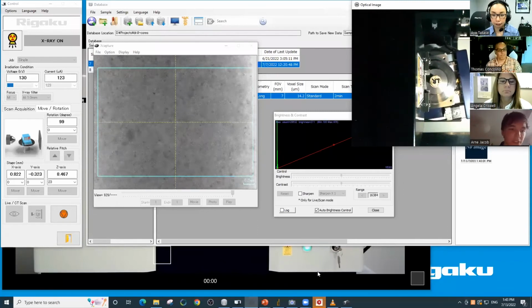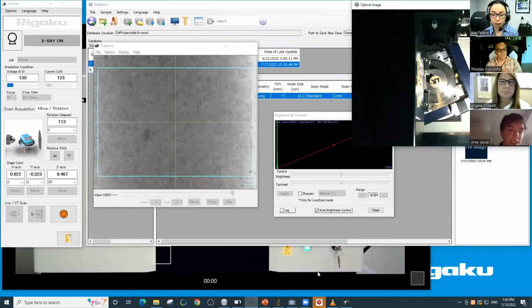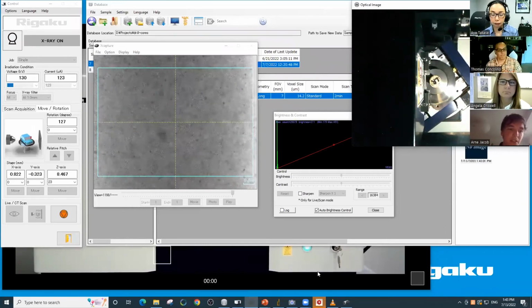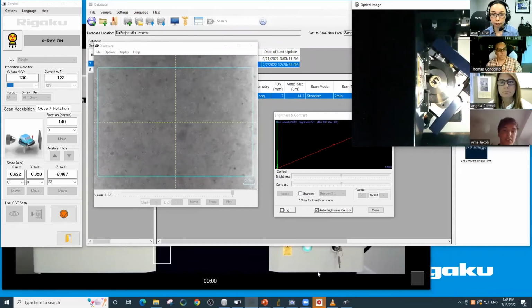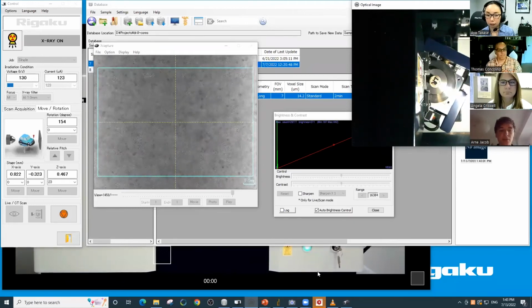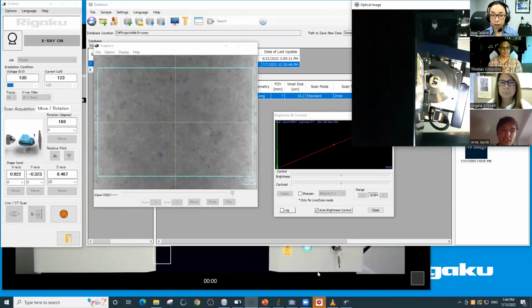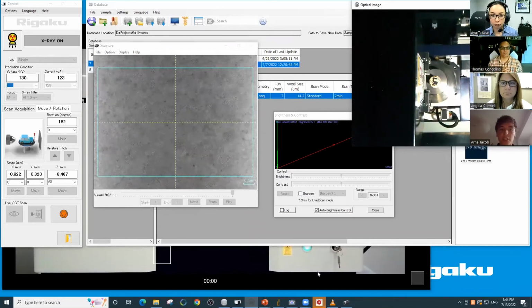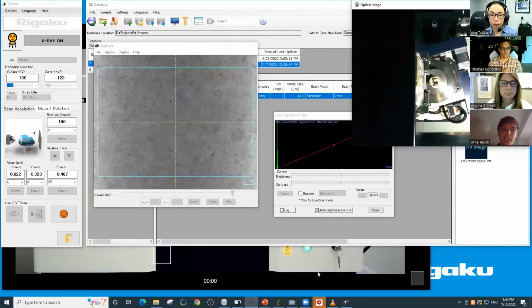Yes, thank you for your question. If you have such a large data set, you may, of course, apply some, let's say, limiting the range to another scale. So you just compress your images. And of course, if you have already processed your data or your images, the data would be much smaller in the software after it is segmented. Then you can handle your data much better.